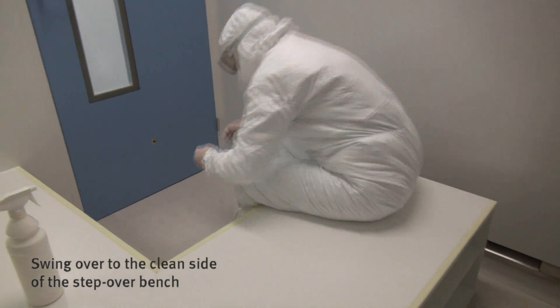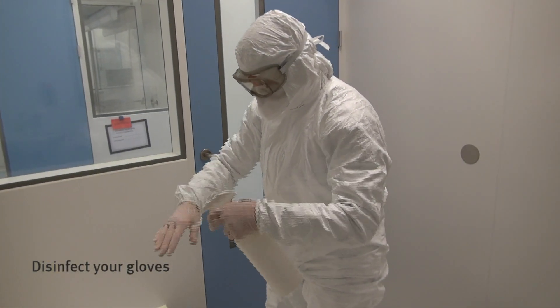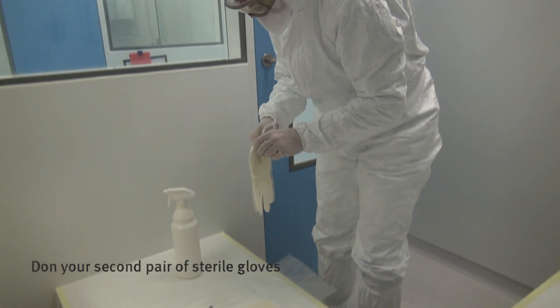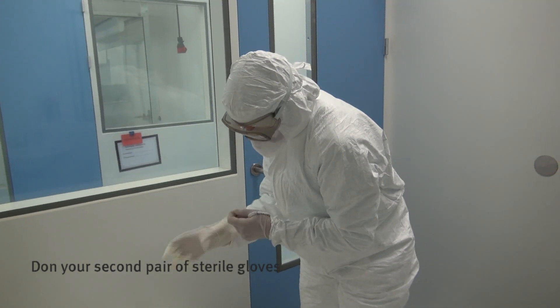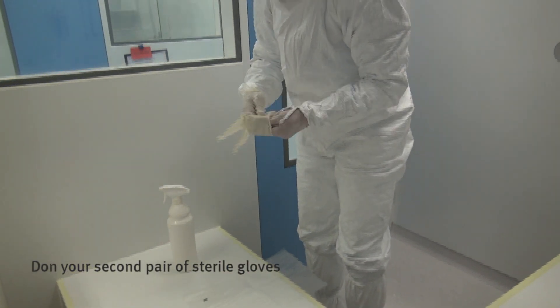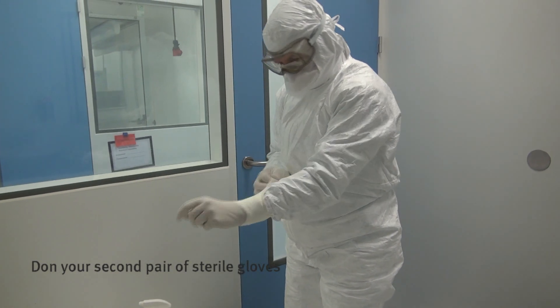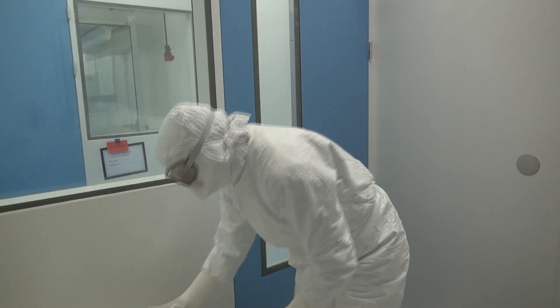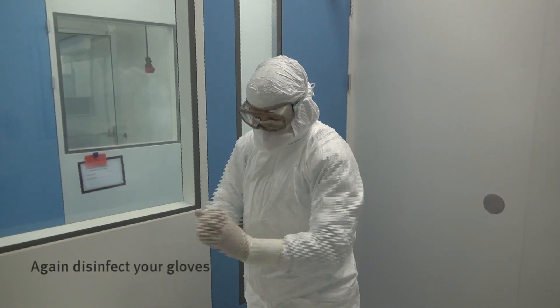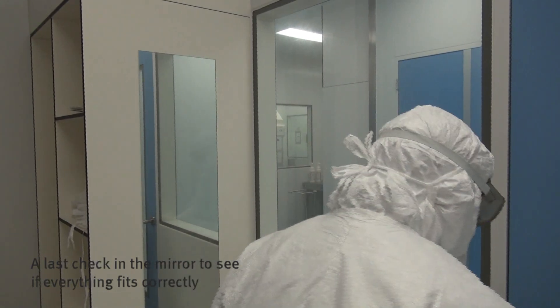Swing over to the clean side of the step-over bench. Again, disinfect your gloves. Don the second pair of sterile gloves. Again, disinfect your gloves. Do a last check in the mirror to see if everything fits correctly. Then, you may enter the clean room.